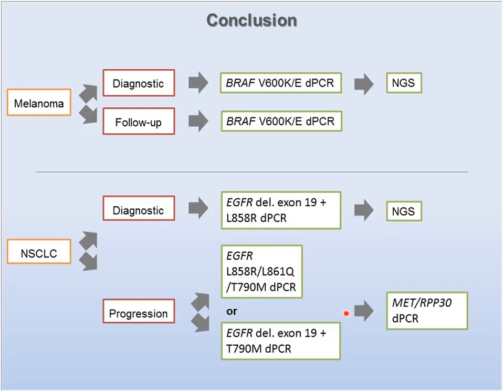If we do not detect this mutation, we also perform an analysis of the MET gene in order to determine a possible amplification of this gene.